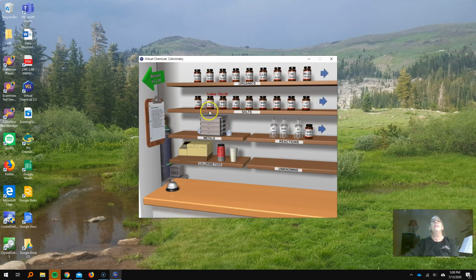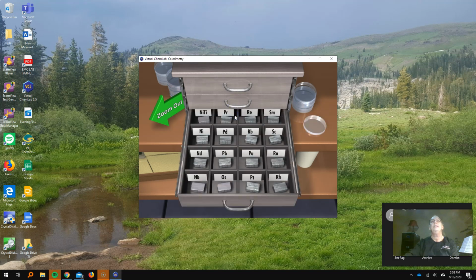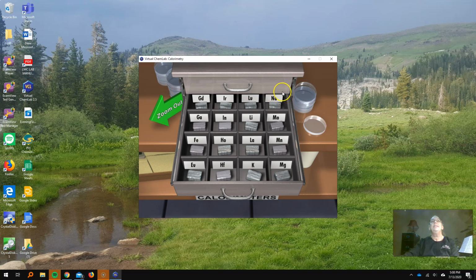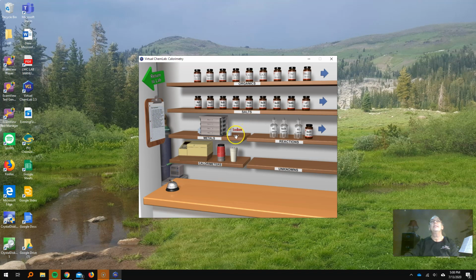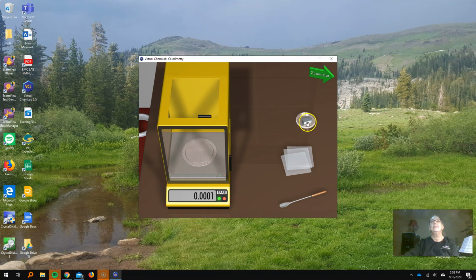Let's see what else we've got to do. We're going to jump to sodium. So let's figure out where sodium is. It might be here. No. Go back. Close that. We need sodium. Where are you? There we go. Put sodium here. Zoom out. Put them there, go back to lab, get ready to weigh this guy, and let's see, this is good, it's close to 0, put it here, and it weighs that much, so write this number down for grams, okay, and then I'll get rid of it.